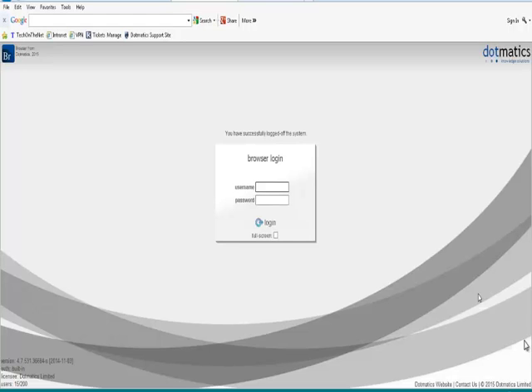So this means the software needs to be installed centrally in one location, and then whoever you give access to the software, they can just access it through their web browser. So potentially you can access the software from anywhere in the world. You don't need to have anything particular other than the web browser installed on your laptop or your desktop, or for that matter, your smartphone.